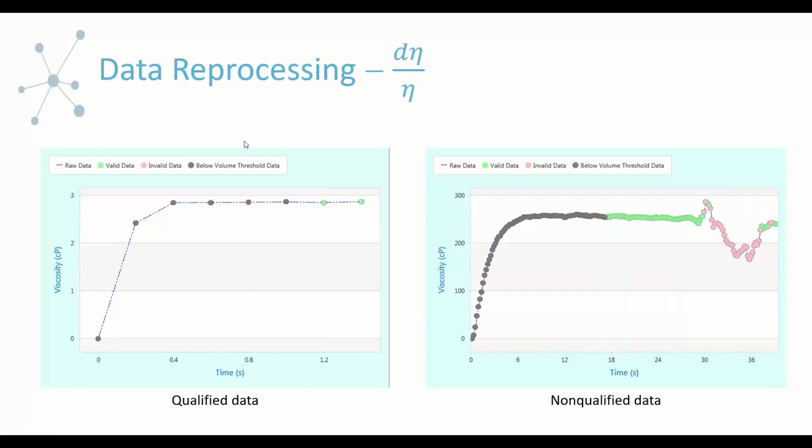But here you get this light blue, which shows that you've reprocessed the data. And so here it's basically Clarity reprocessed only these 2 points and deemed it okay. And then here, Clarity looked at all the points that are highlighted in green or red. And so this was a huge bubble. So there was no rescuing that.